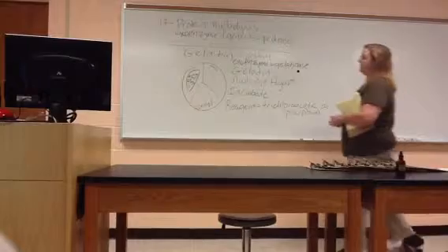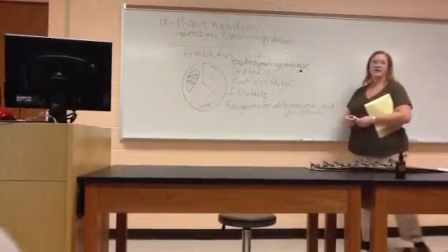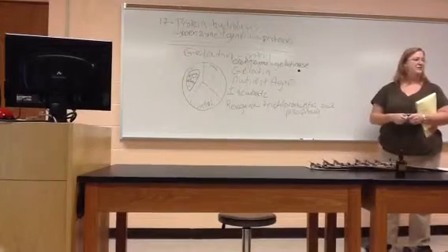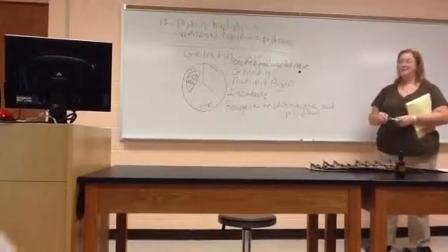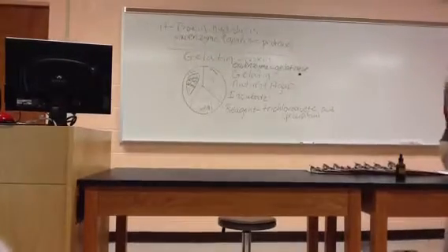If this is our negative bacteria, it's not producing gelatinase. We add trichloroacetic acid, what's going to happen? Cloudy and white. It's going to turn cloudy and white. Yep. So negative result. There will be a white color around the bacterial growth.